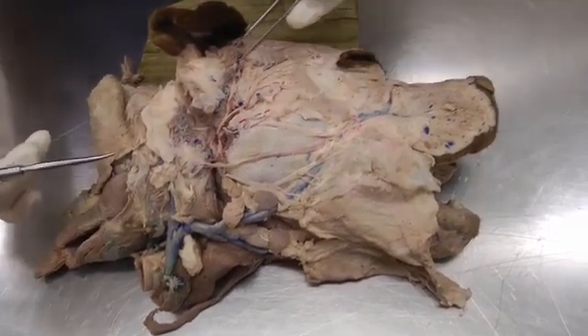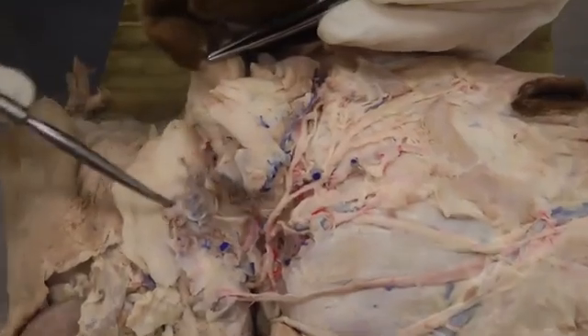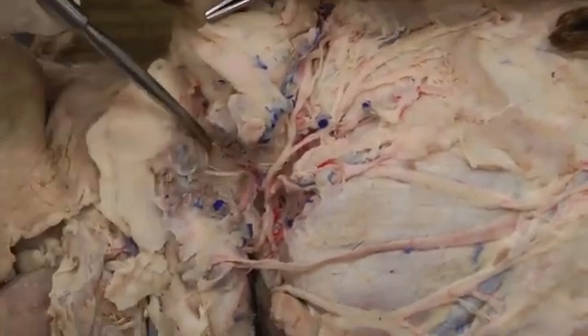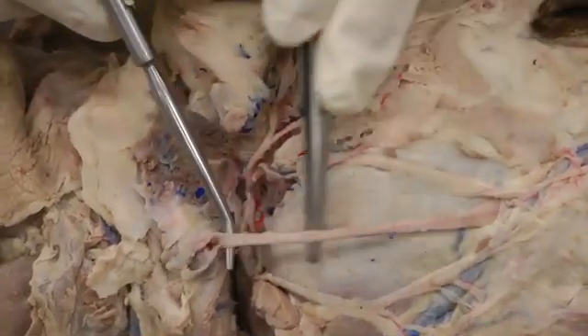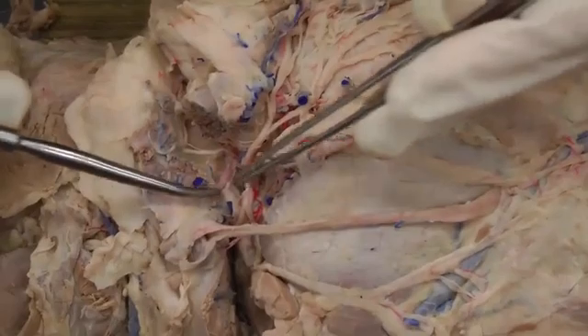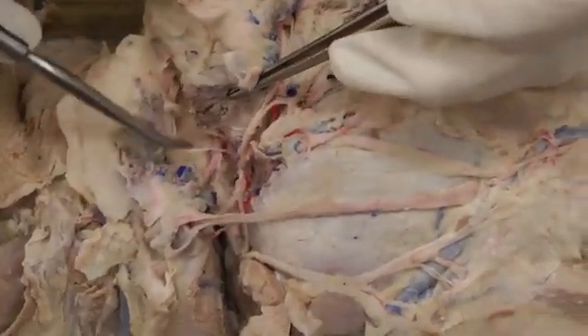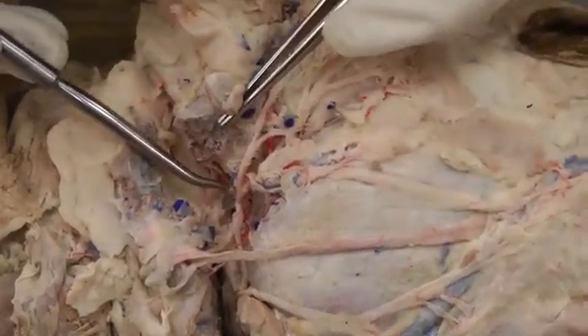We're starting on the lateral side here just at the base of the ear. You're digging down deep underneath your parotid salivary gland. I kind of tore that apart and tried to keep the parotid duct intact here so I could have that reference point. Then I cut through the gland itself and you're digging deep in behind the ear. What you're looking for is the facial nerve.